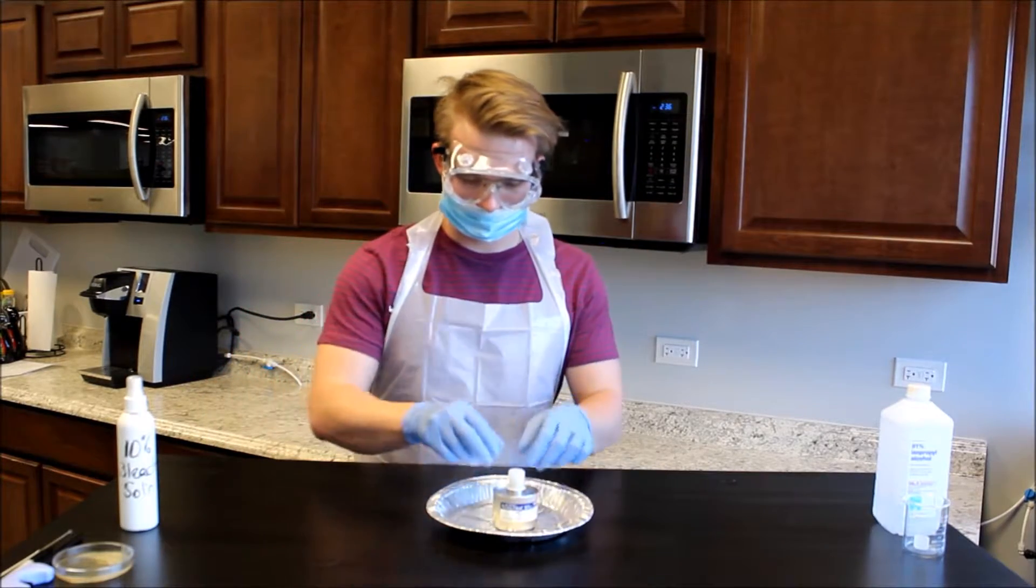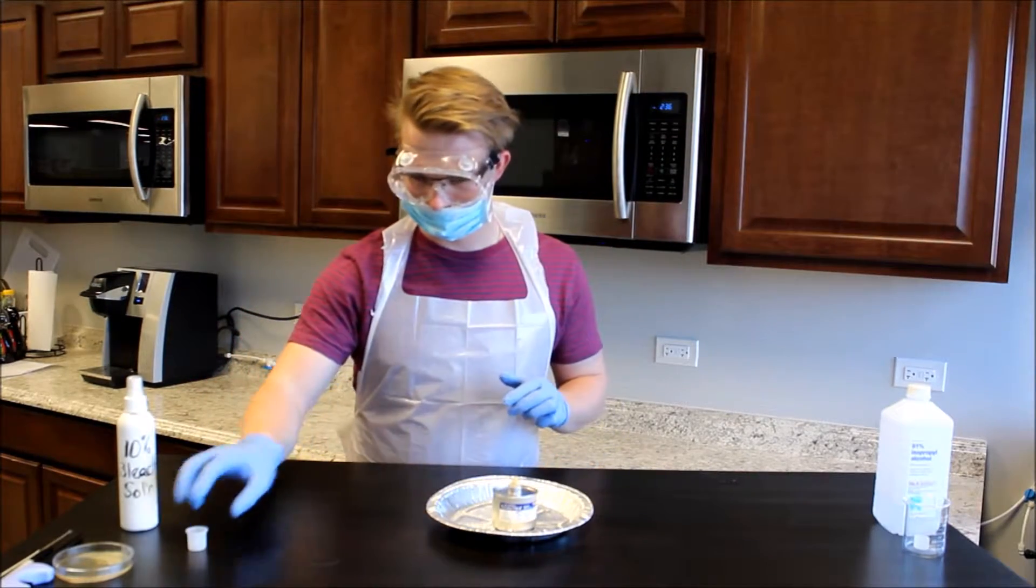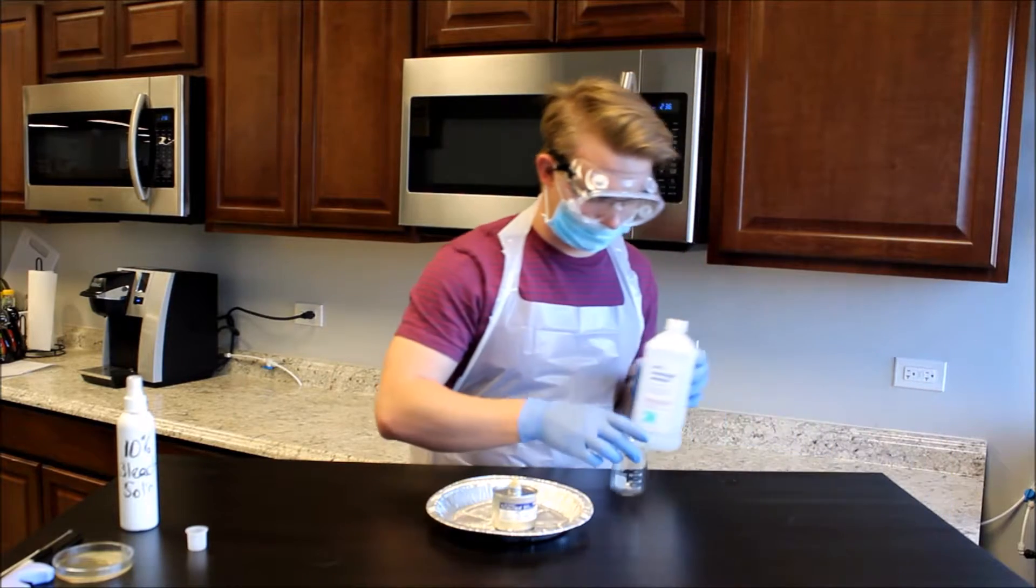Place the aluminum pie pan on the cleaned work surface. Place the burner fuel canister in the pie pan.